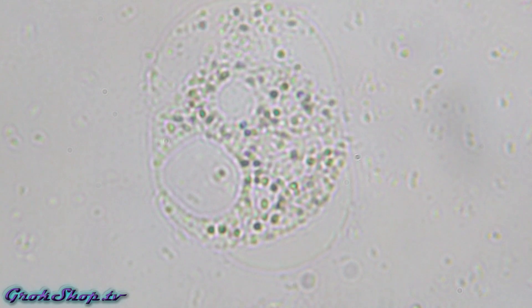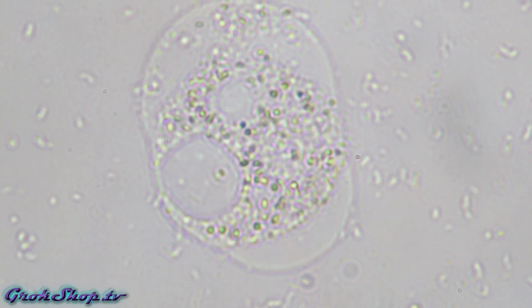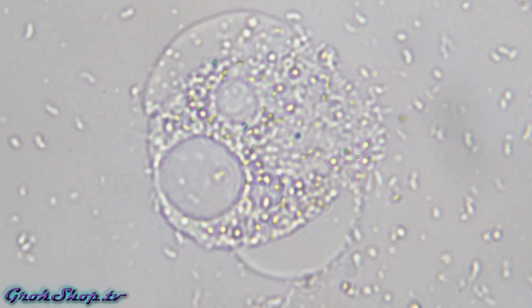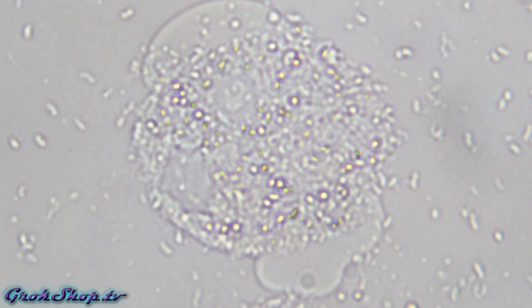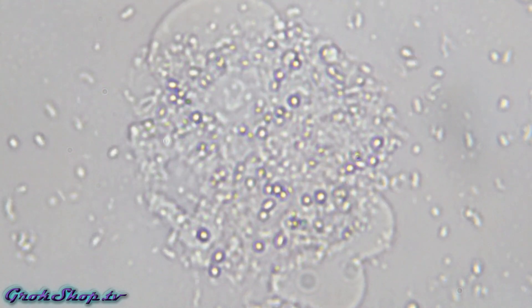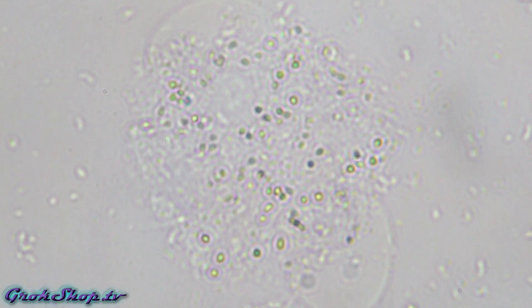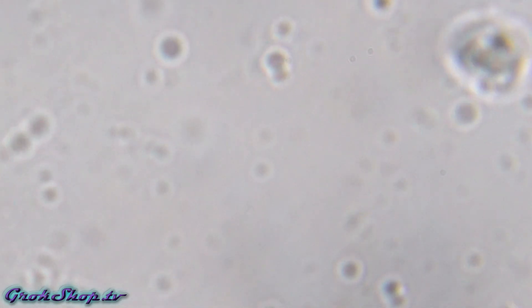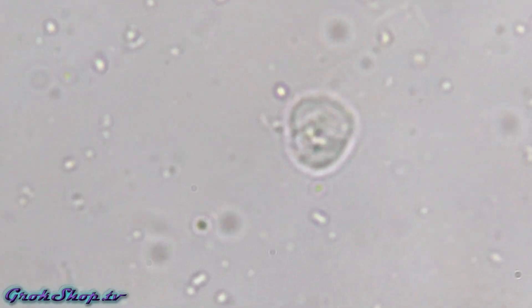This one's a mystery to me — looks kind of like an amoeba, not totally sure. Could just be a bubble of some sort — and we have membrane bustage, it is busted open. Speaking of amoeba, it looks like we have a naked amoeba here, caught in a current, just floating along.